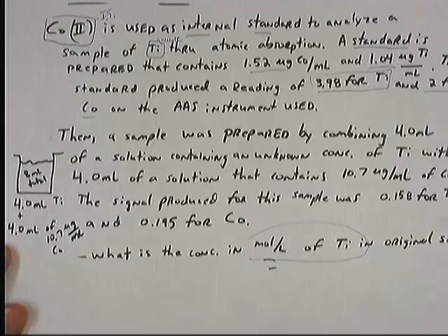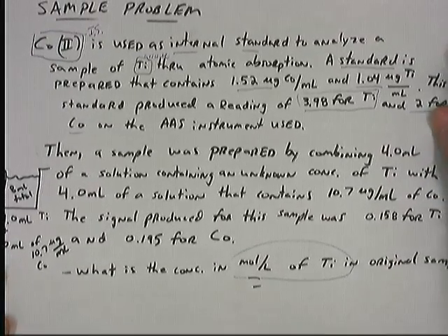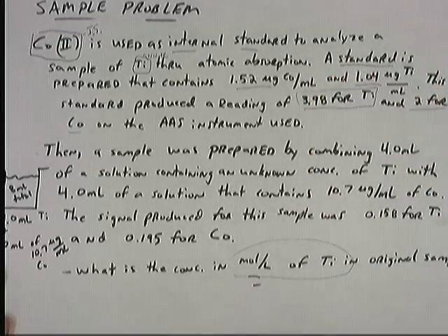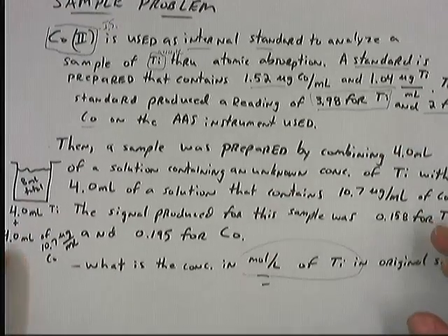I'm going to analyze it by the same exact method of atomic absorption spectroscopy that I used to get this calibration data. It's important that it's the same method, because if you change specific characteristics of the detector, or you change settings on your instrument, that could change the response function. Okay, so you don't want to do that. You don't want to change F. It has to be exactly the same method. And that's what we're going to have here, exactly the same method.